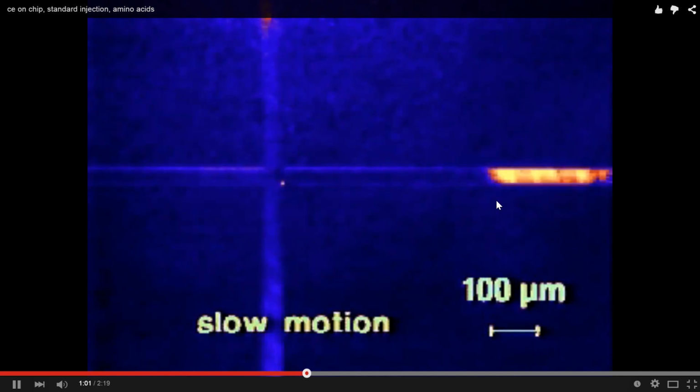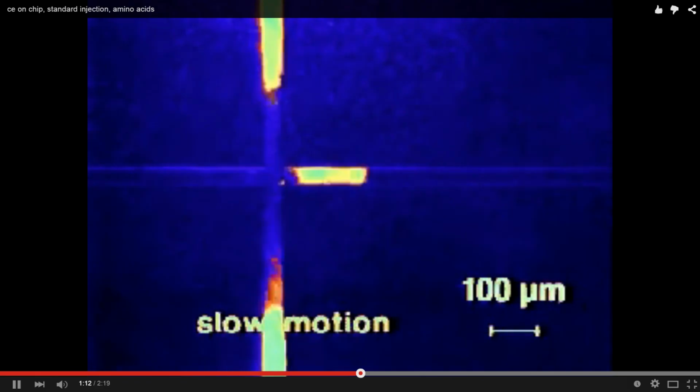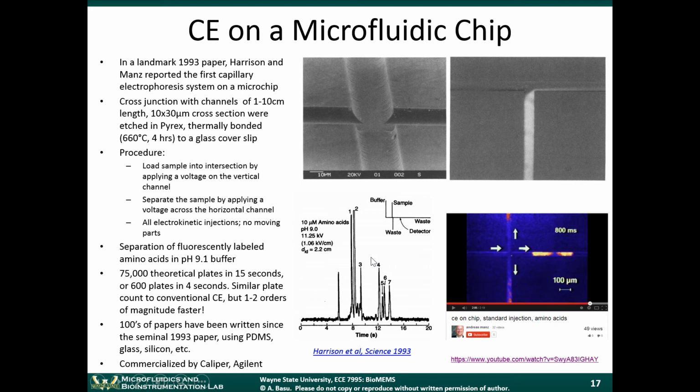If you had a detector sitting here on the right side just watching what comes by, you'll get a series of peaks. So this is what an electropherogram might look like. They were separating amino acids in this particular example, and those amino acids were fluorescently labeled so that you could see them moving through the channel.